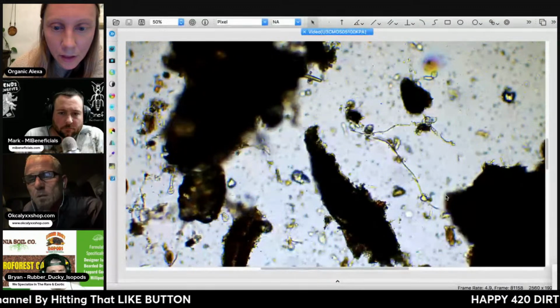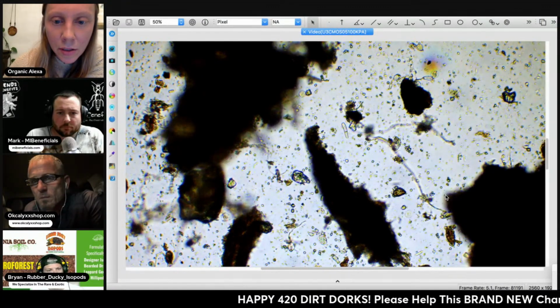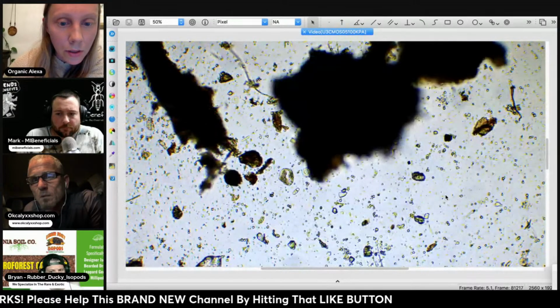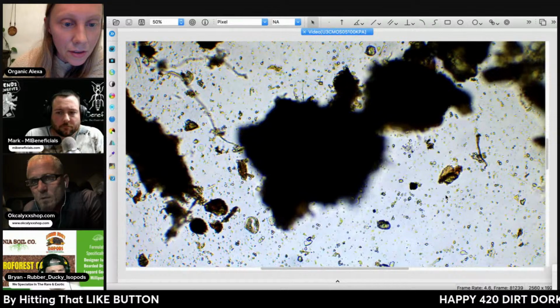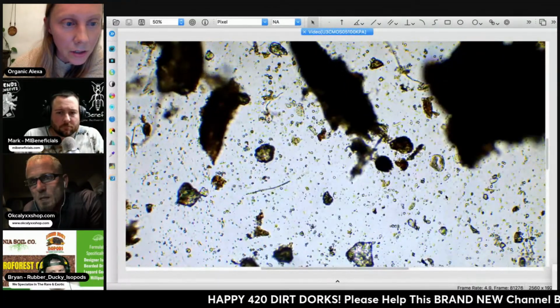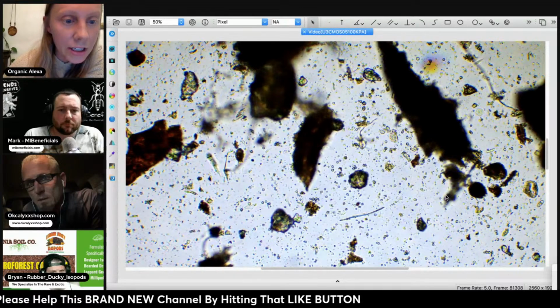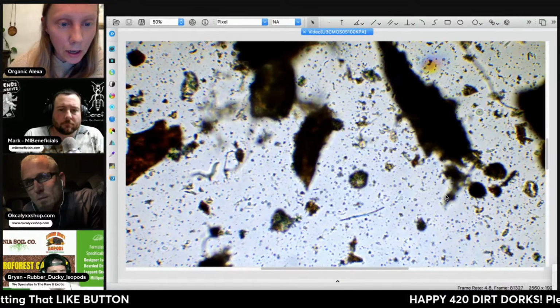A lot of flagellates are really hard to see with a microscope because they're only like 5 to 10 micrometers in size. There are a lot that are really tiny in here that I do see, but it's probably really hard for you guys to see. They're really hard to see with a microscope in general. How quickly they move is how you distinguish them from bacteria. Flagellates in general are super cool.